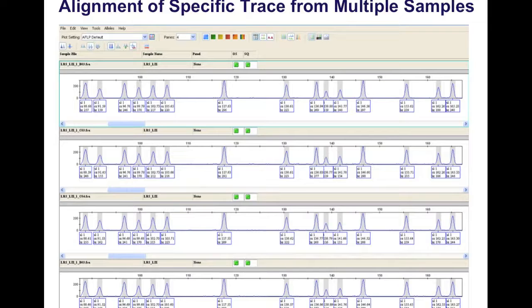A unique feature in GeneMapper is that you can align all these traces from multiple samples. That is something you cannot do in sequence analysis software, and that is a very powerful feature in GeneMapper. You can align multiple samples and focus, for example, on the G traces. You can immediately see any differences, if there are any, from sample to sample.